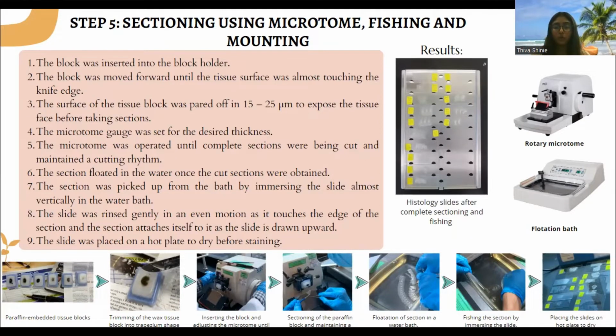The microtome was operated until complete sections were being cut and a cutting rhythm was maintained. The section was allowed to float in the water. The section was picked up from the bath by immersing the slide. The slide was placed on the hot plate to dry before staining.